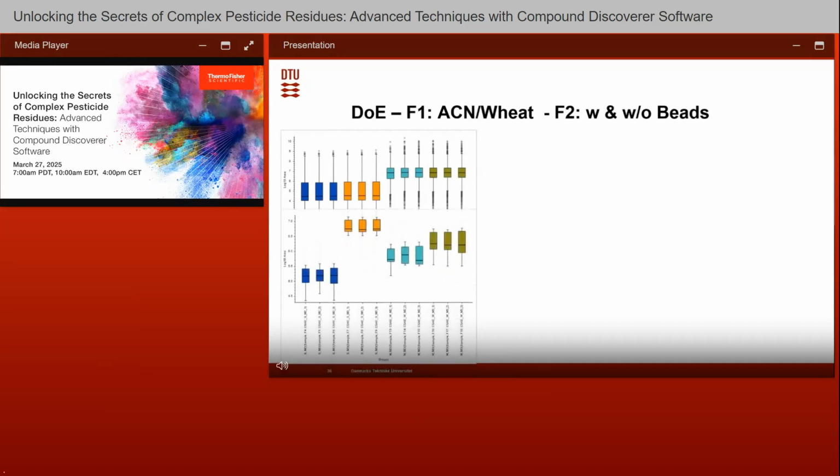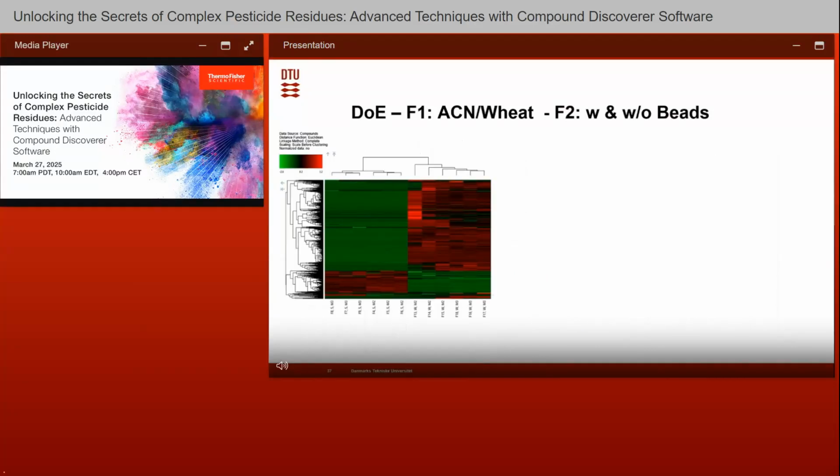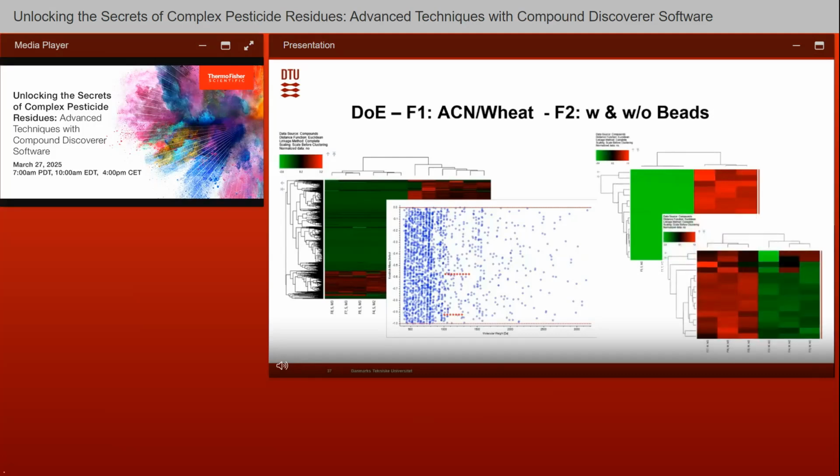You can see here the M3, which is the only bit in a different position, and the PCA plots show the same behavior as well as the different clusters. So we have here the same situation. The same separation is only because of the compounds already pre-selected.